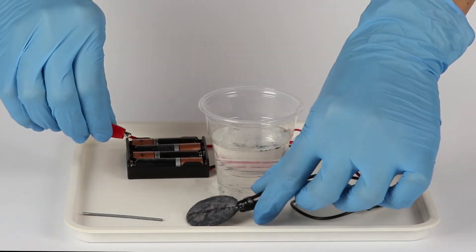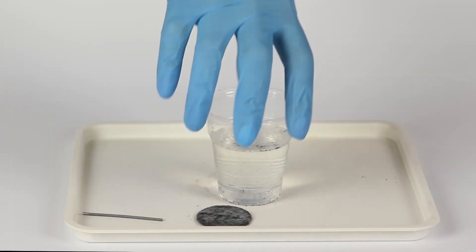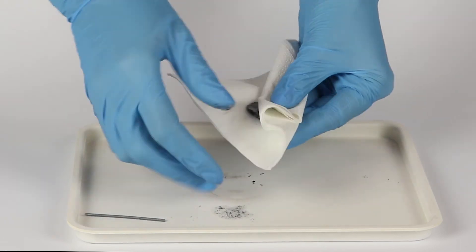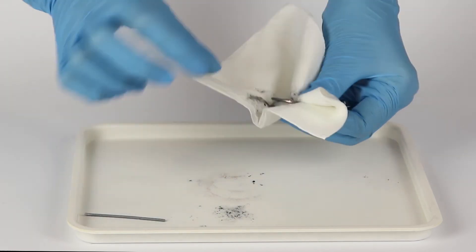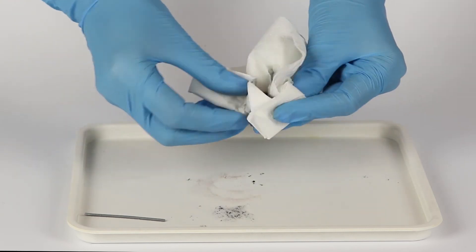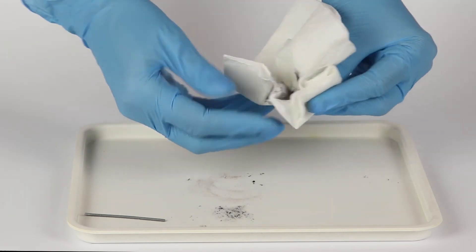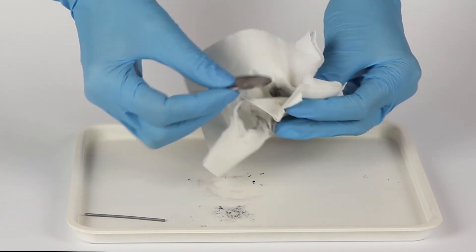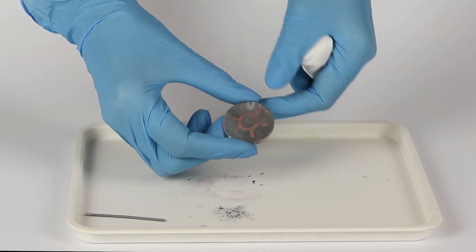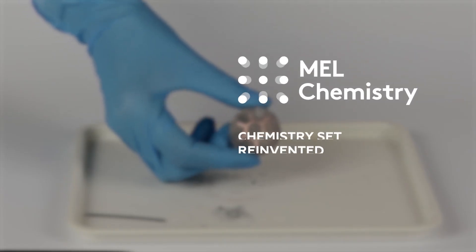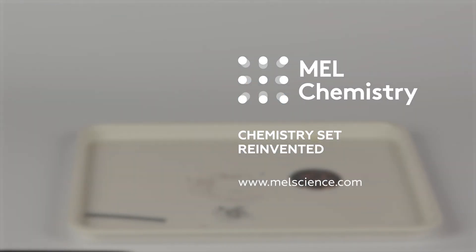Disconnect the wires. Wipe the disc with a napkin and reveal the image. Learn more about this experiment on our MELScience website.